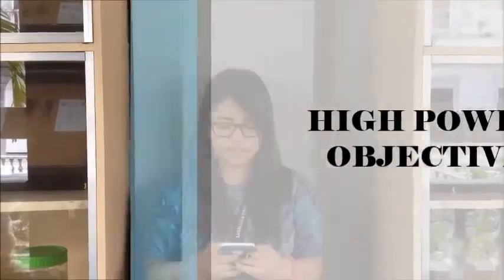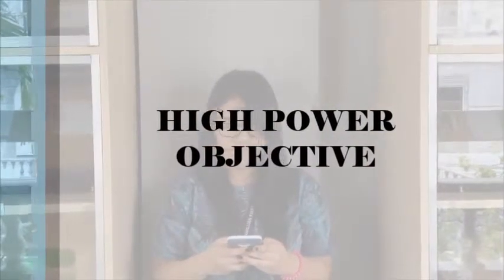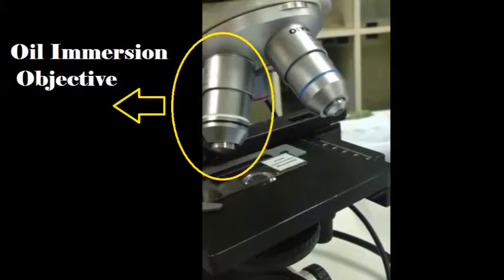High power objective. This objective, sometimes called the high-dry objective, is useful for observing fine details such as the striations in skeletal muscle, the arrangement of Haversian systems in compact bone, and types of nerve cells in the retina.